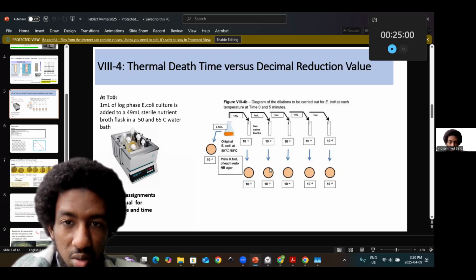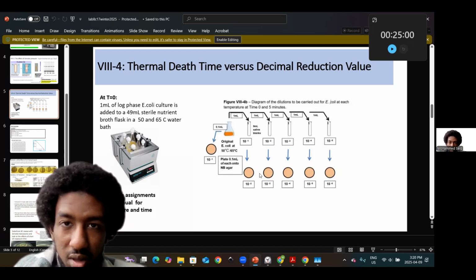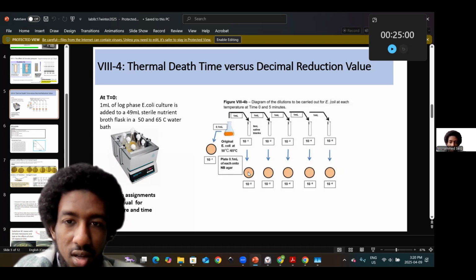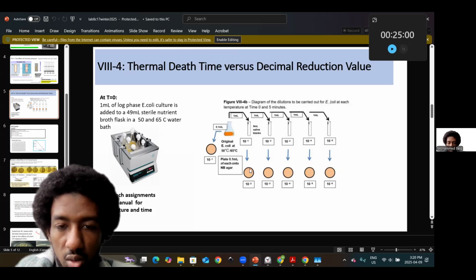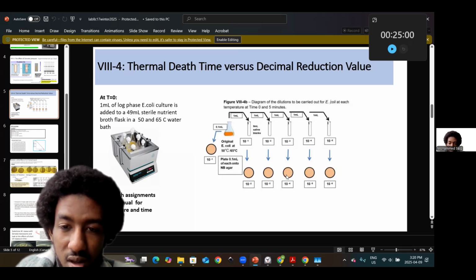Like if let's say your colonial growth, right? Some of them, it makes sense that if you have colonies that are too many to count, let's say this is like 3,780, this would technically be too many to count. You'd probably see too many colonies following incubation, right? But then slowly you'll see, oh, let's say it's 378, right? It's 10 times less. Still a bit too many to count. But then thereafter, you'll get probably 38, because divided by 10, you wouldn't just say 37.8 colonies, unless you were averaging, but you would say 38 colonies.